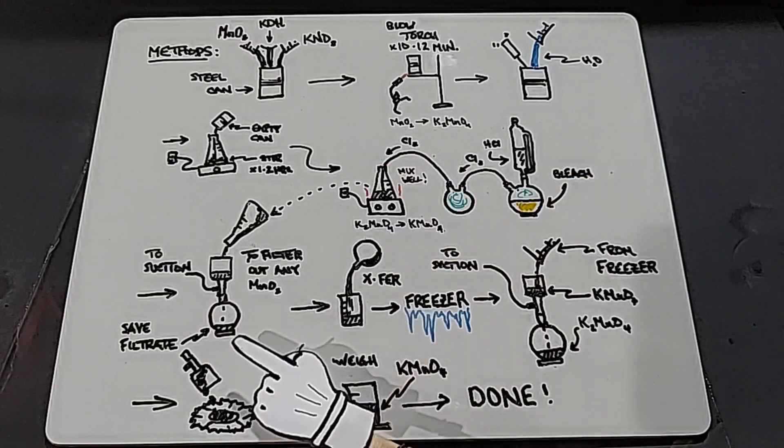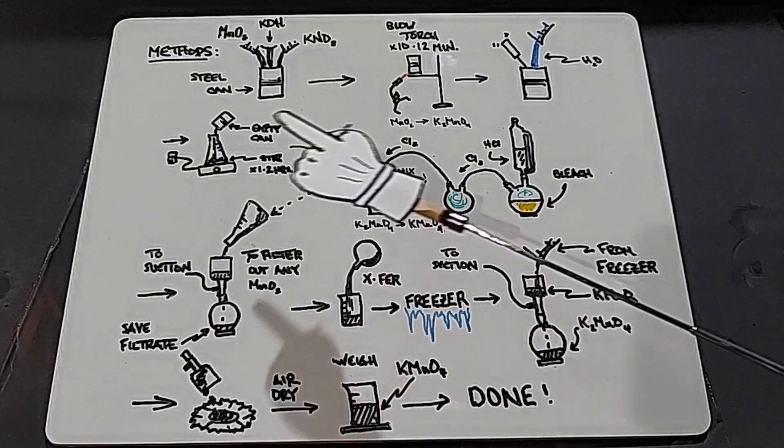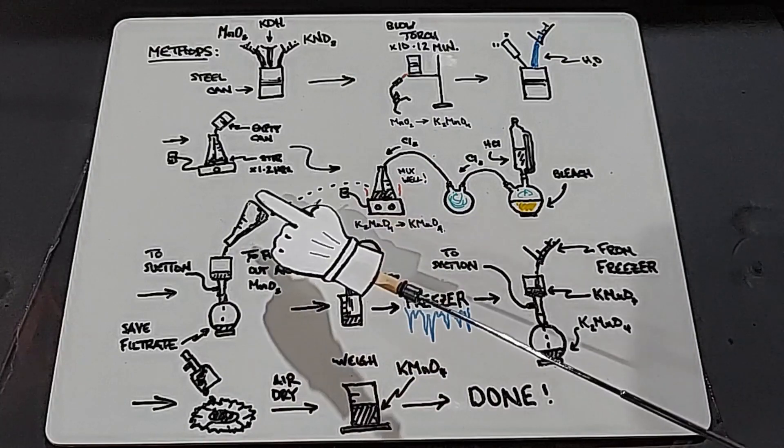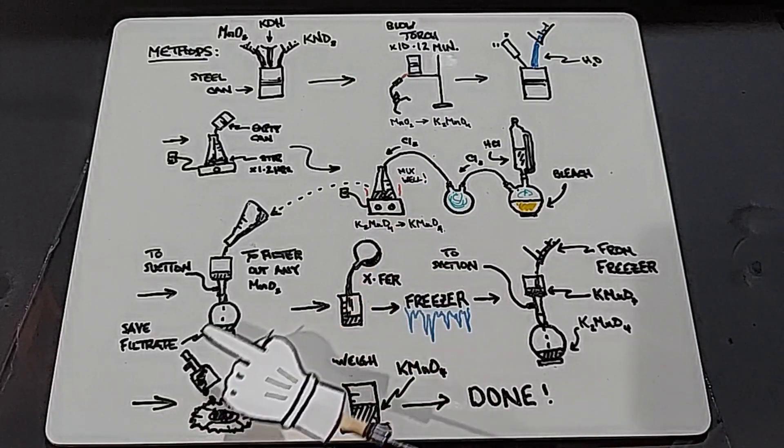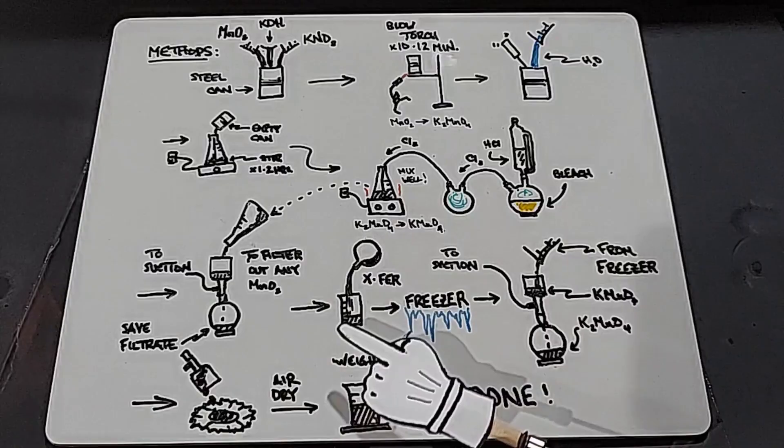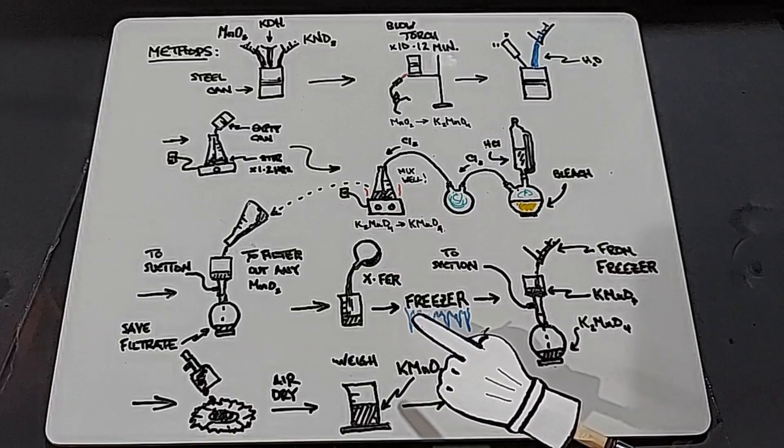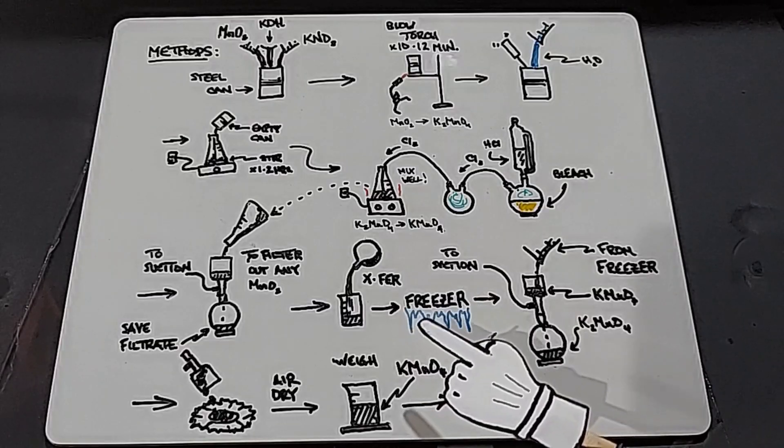After this has been stirring for a while to make sure all the chlorine gas is mixed in well, I'm going to suction filter it and save the filtrate. At this point, we're going to suction out any manganese dioxide that might still be unreacted. Then we're going to transfer the filtrate into a beaker and put it in the freezer. As I said earlier, the potassium permanganate will come out of solution first.